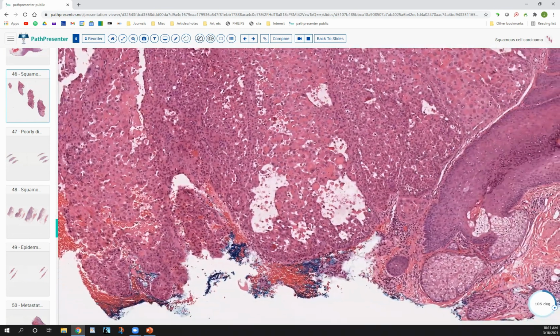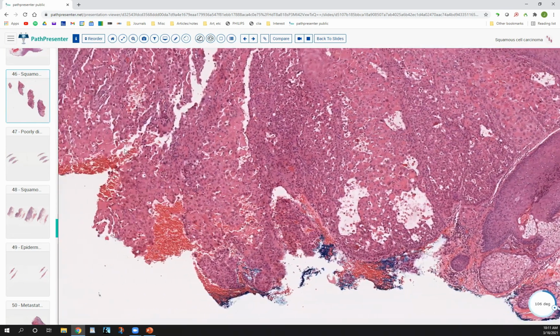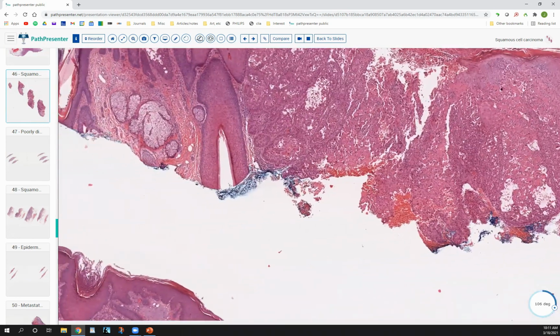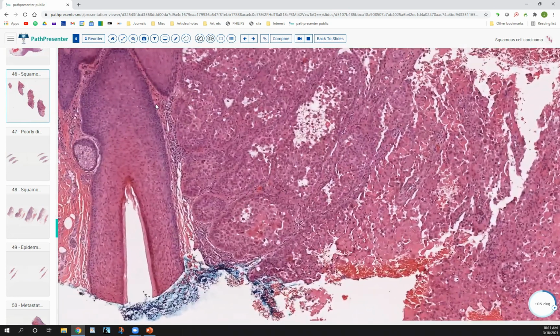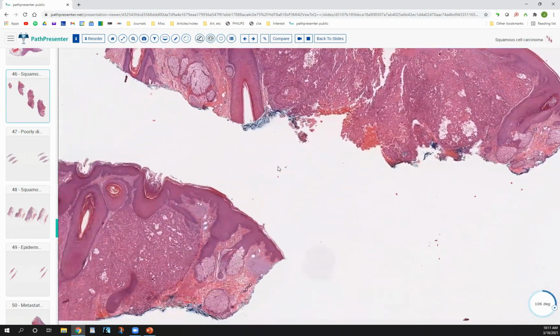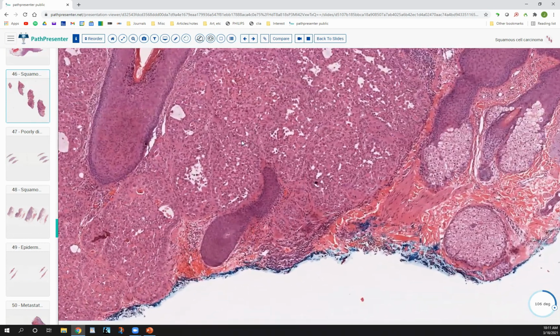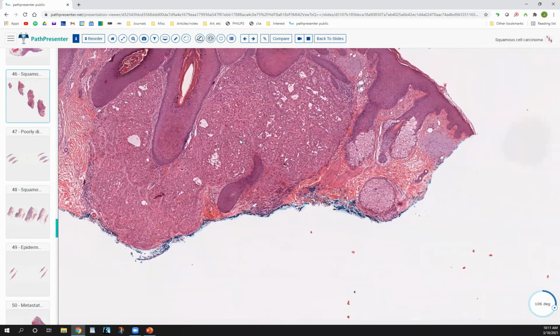We have these falling apart of cells. The difference is you have a malignant growth, right? You have downgrowth of the highly atypical cells into the dermis. So this is pretty easy to recognize as squamous cell carcinoma. And it used to be when I was training that they thought these had a more aggressive biological behavior, although I think that is not the case anymore.